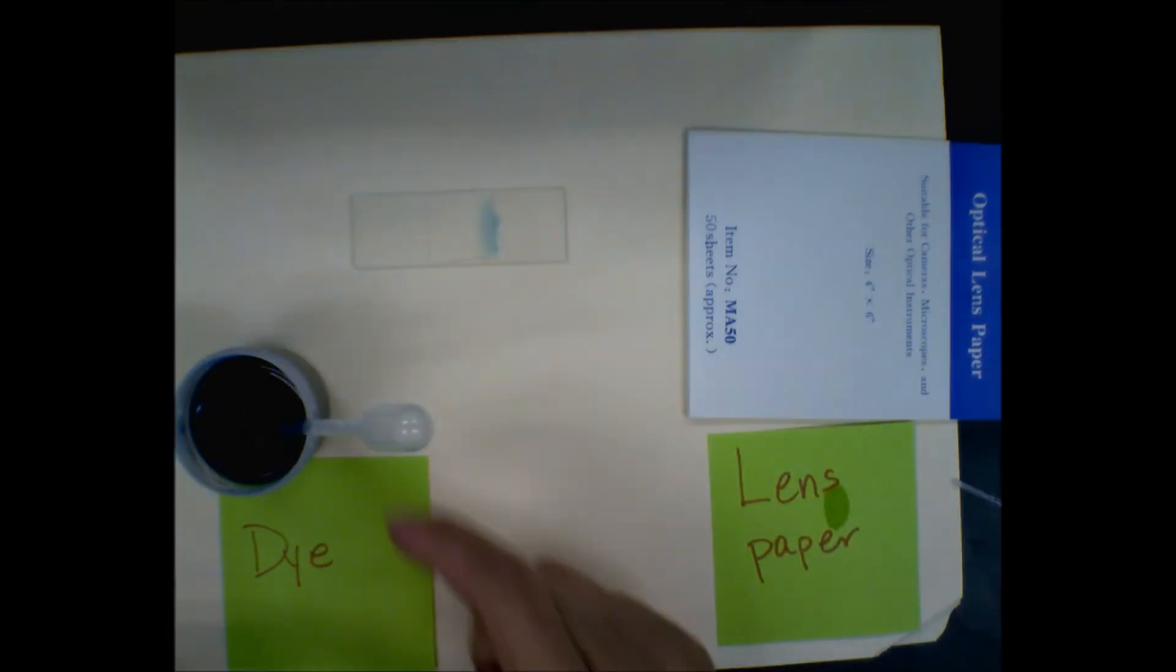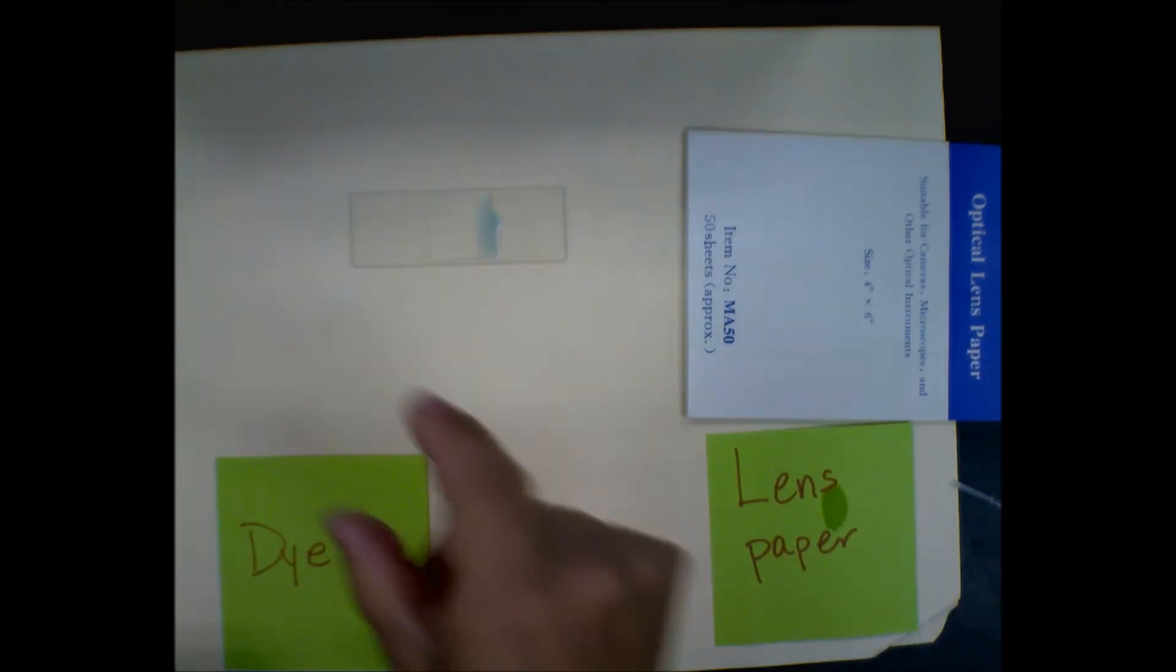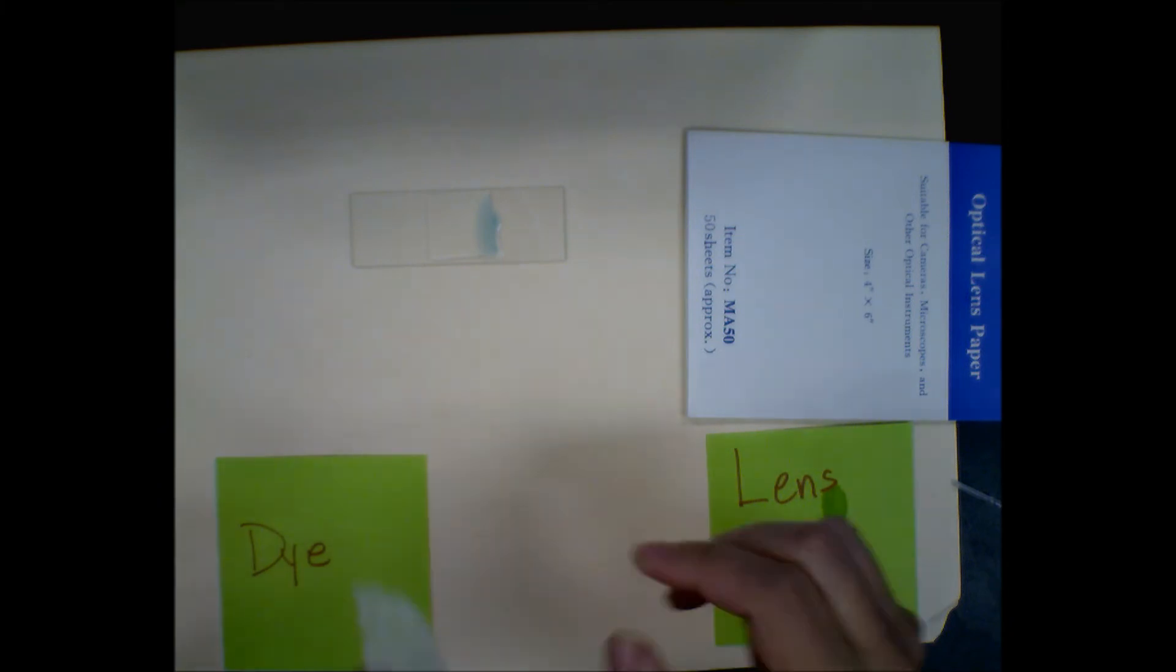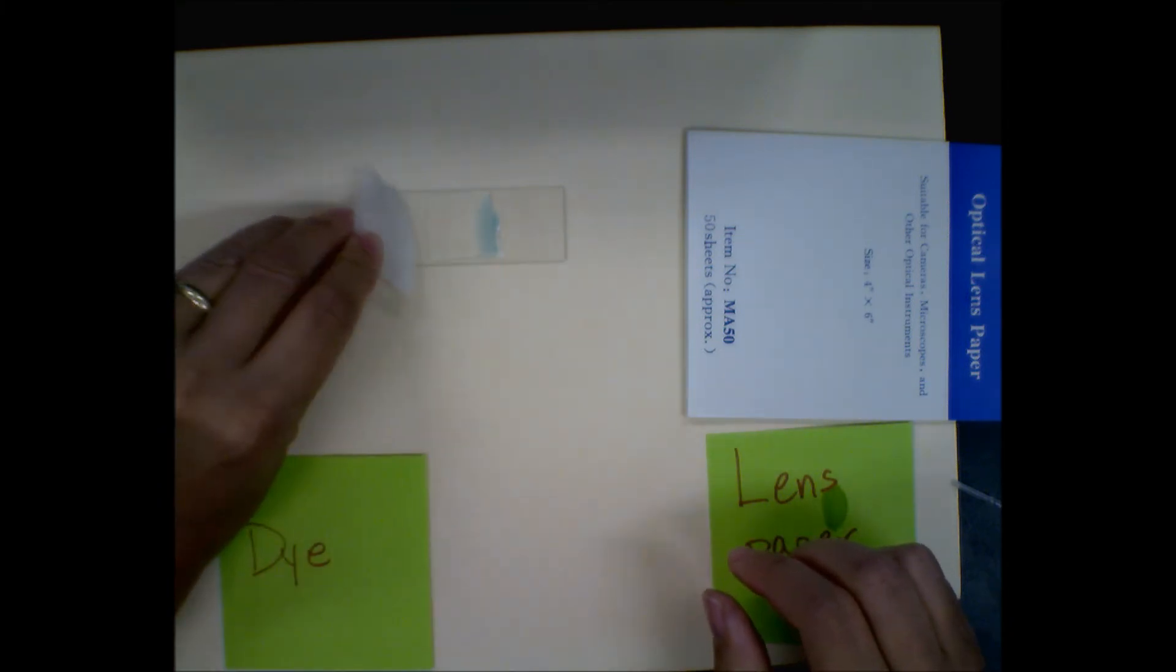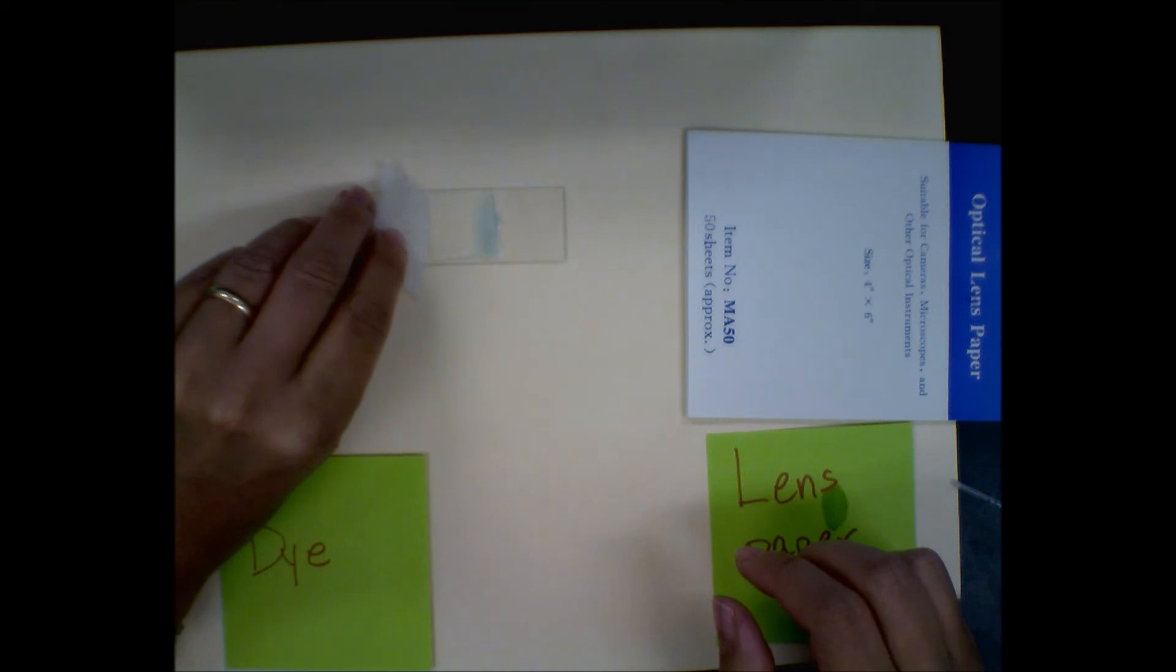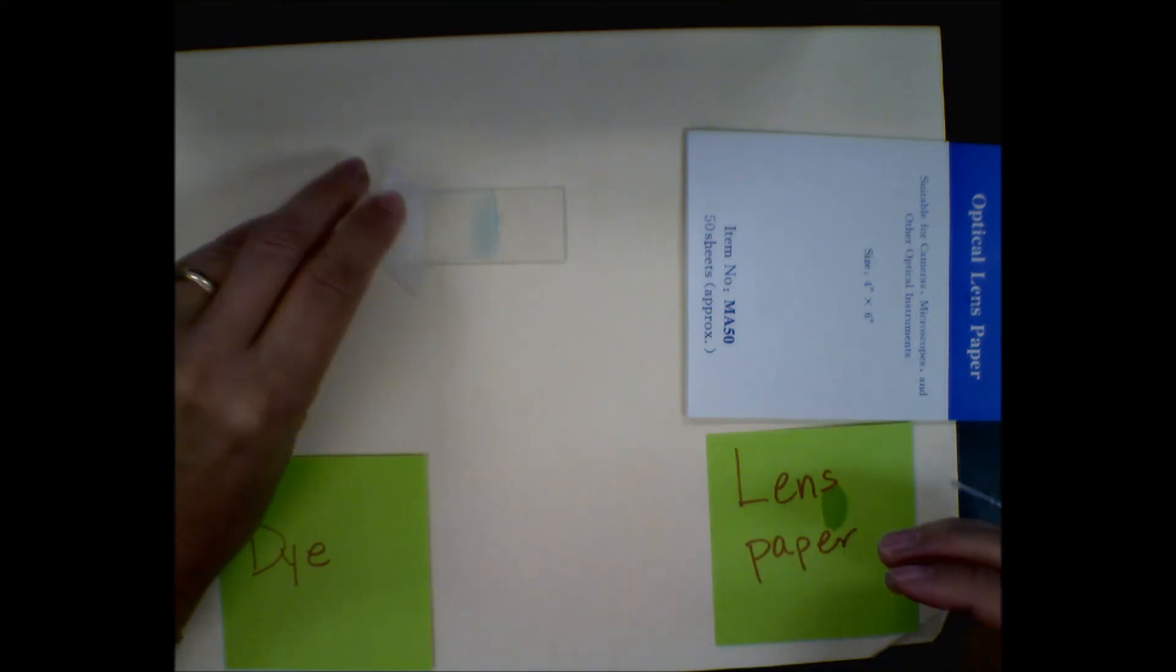You can see it started to go under but we need it to go most of the way through. Now you take the edge of your lens paper and stick it on the opposite side, and it will start to draw some of the water into the lens paper which then pulls the dye across your slide.